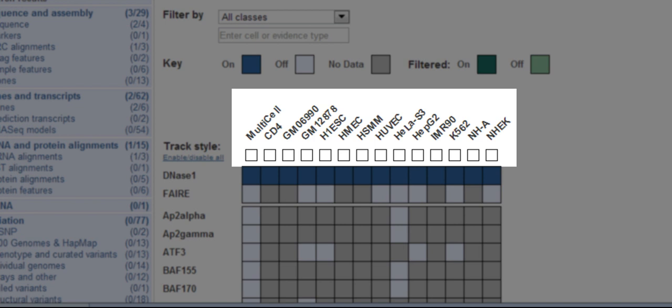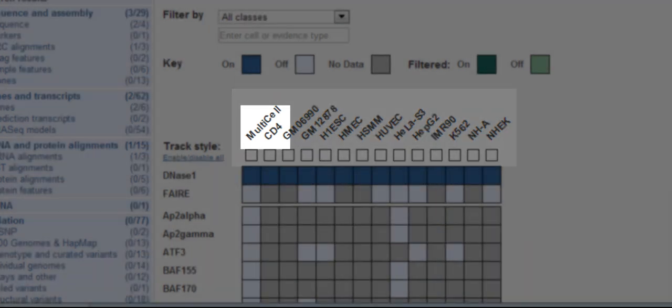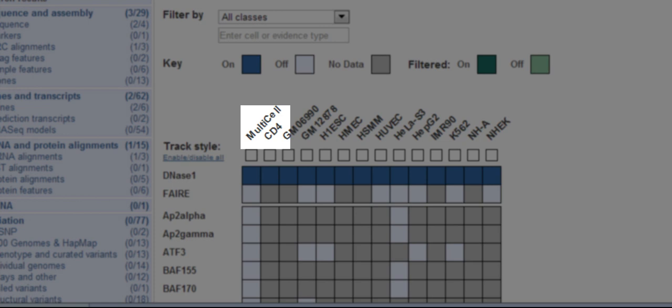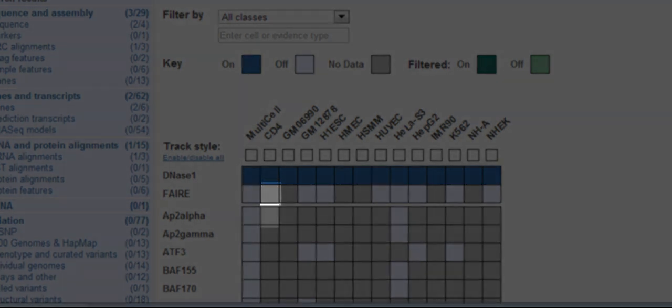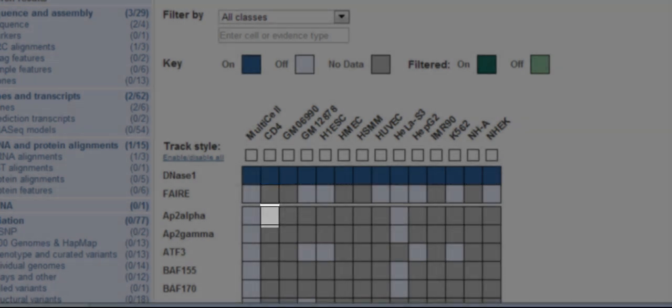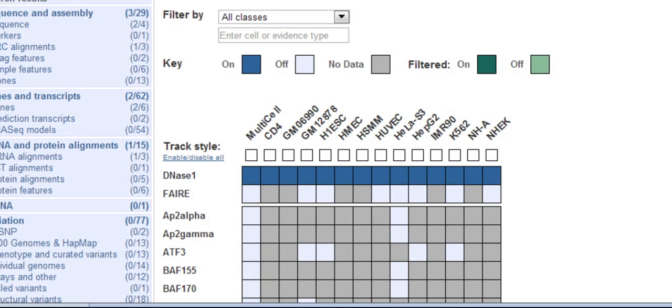Along the x-axis, we have different cell types and a multi-cell option that brings together the data for the single cell types. Dark blue boxes are on, light blue boxes are off, and grey boxes mean there is no data for that particular feature in that particular cell type.